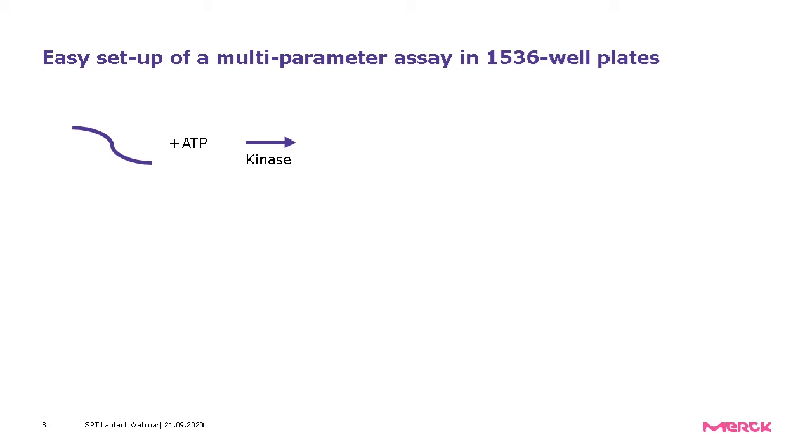In the following presentation, we want to show you with two examples how we used the Dragonfly Discovery for assay development for our high-throughput screening. I will go into detail on how we set up a kinase assay with the Dragonfly, and Adrian will later talk about a protein-protein interaction assay.